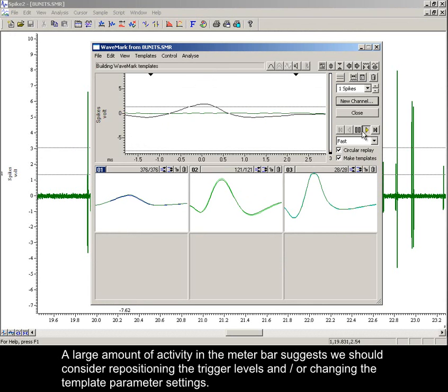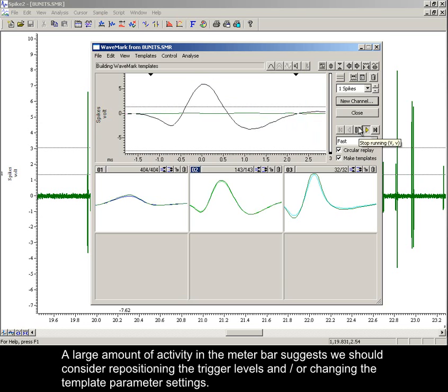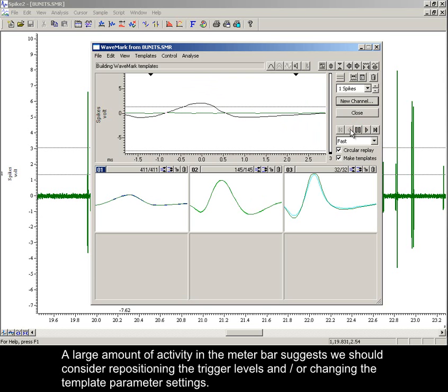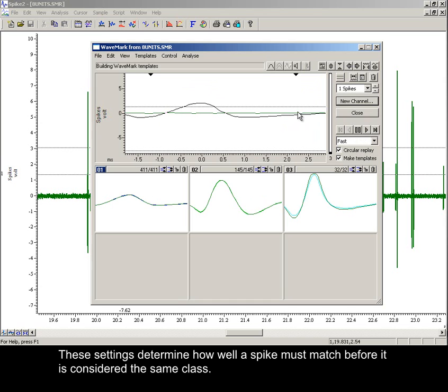A large amount of activity in the meter bar suggests we should consider repositioning the trigger levels and/or changing the template parameter settings. These settings determine how well a spike must match before it's considered the same class.